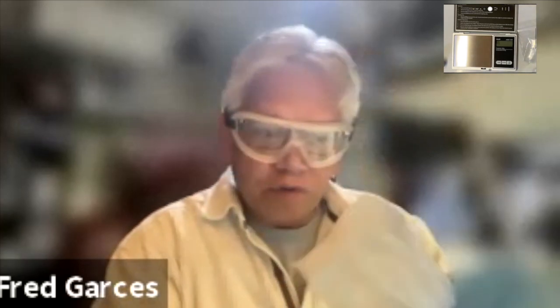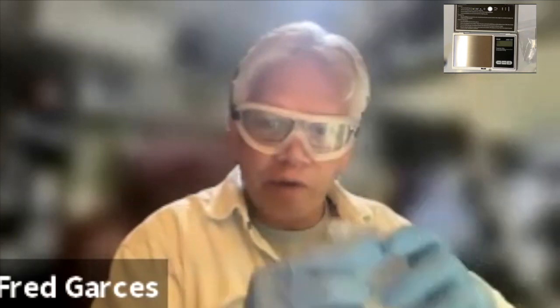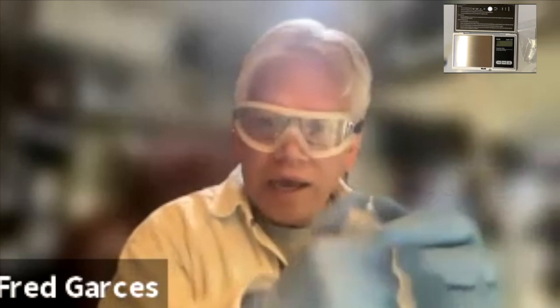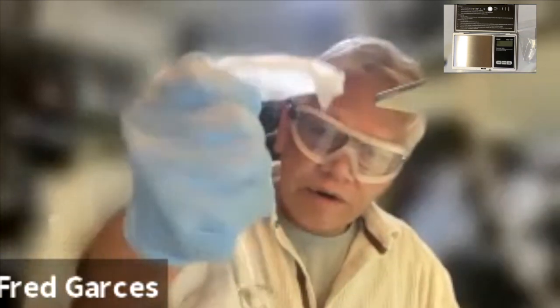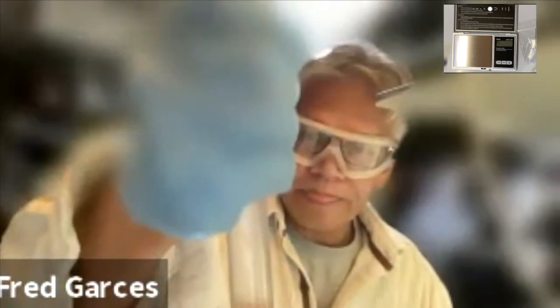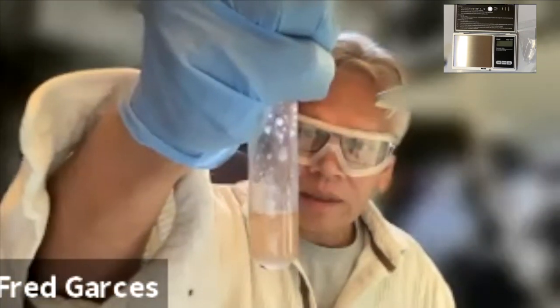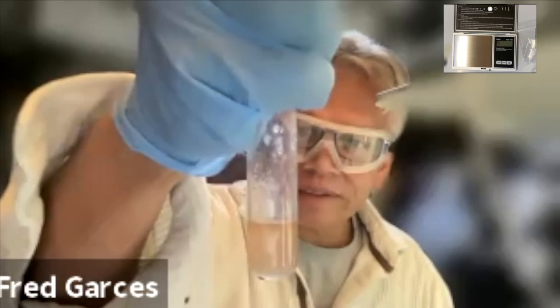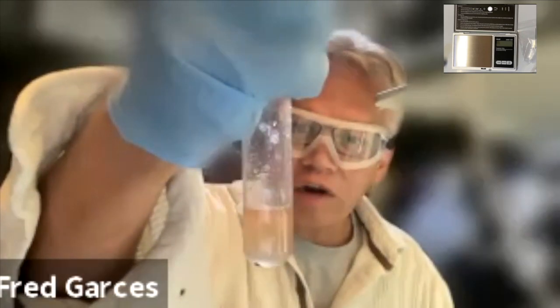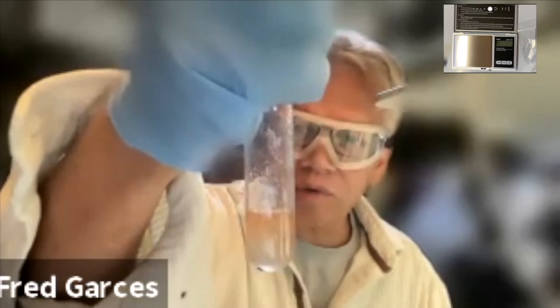And I'm just going to, because I need to shake this, but I can't allow it to spill everywhere. So what I'm doing is I'm just putting it here. I've got my saran wrap and then I'm shaking it. Okay. And as I shake it, you're going to see that the liquids are going to mix and the liquids that are miscible will come together. The liquid that is immiscible will stay apart.